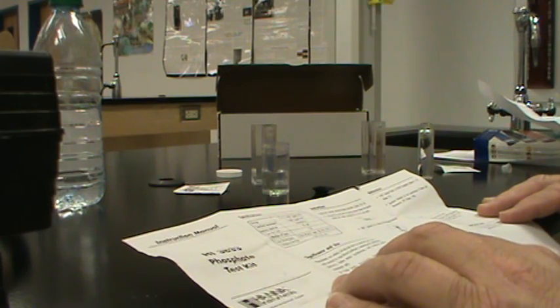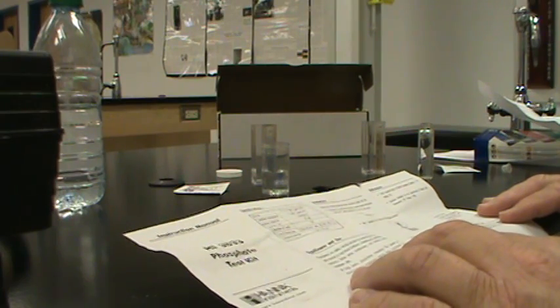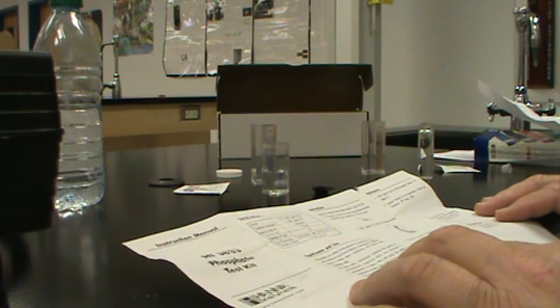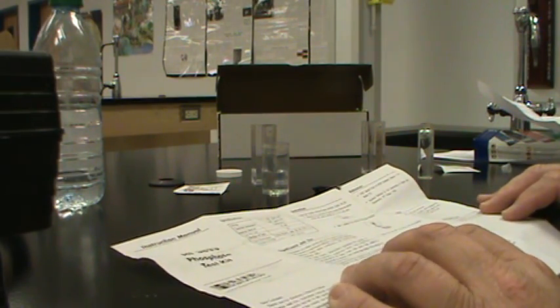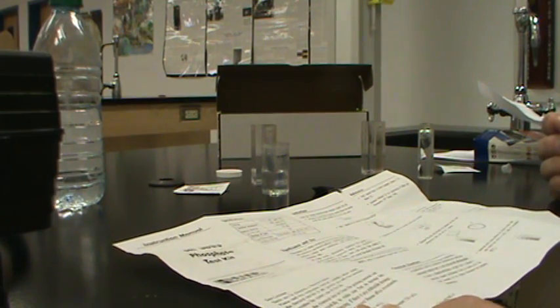This may contribute to the contamination of lakes, rivers, and ponds. This makes it important to monitor and control phosphate discharges into the environment. Phosphates can be classified as ortho, condensed, and organically bound. This phosphate test kit will only determine orthophosphate levels. Now it's very important that a milligram per liter is the equivalent to parts per million. We will be figuring in both of these.